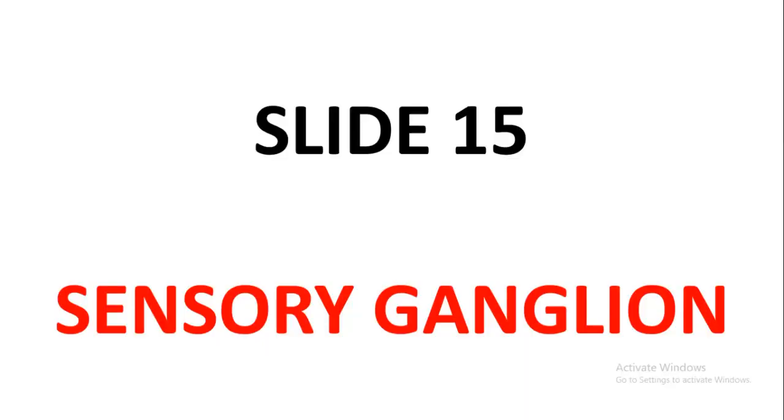All right. Okay. The next slide of interest is the sensory ganglion. So in this sensory ganglion, what are we trying to understand? What are we trying to look for?